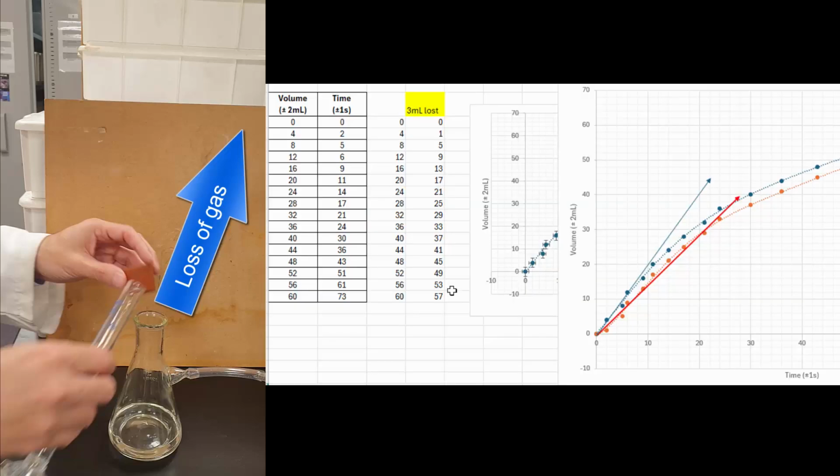The second thing we're going to look at here is when you try and put the stopper into the conical flask, there's some gas that escapes. To mimic that, I've just taken 3 mils off the start. You can see when you try and draw the line of best fit here, that's the orange one, that it dips a little bit at the start. And so you're sort of unclear. It could be really bad if you do it like this.